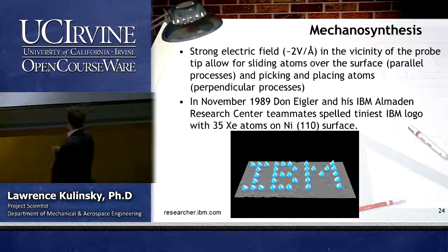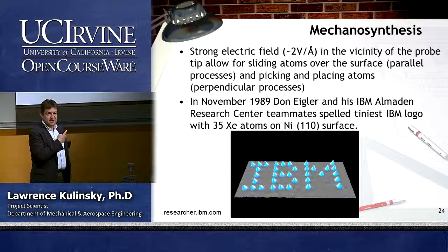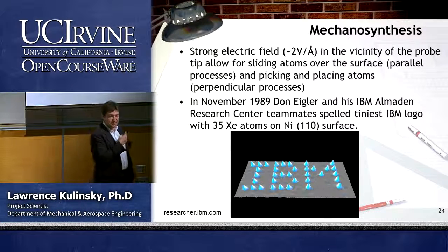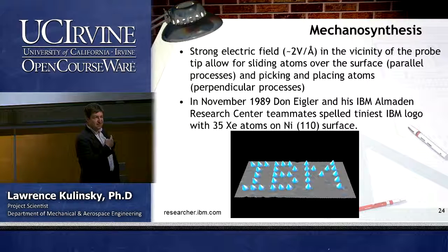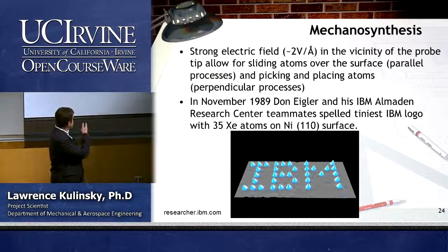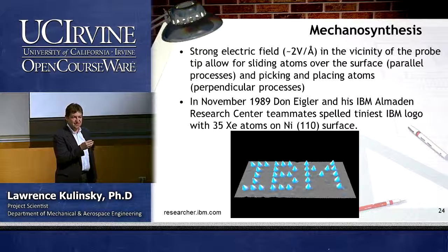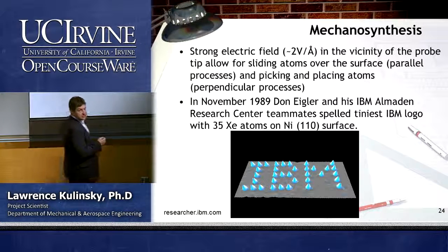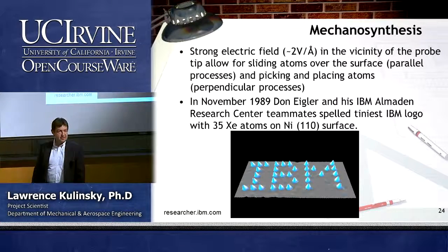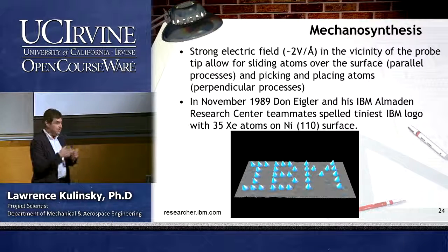So in November of '89, and that picture actually prompted me to go into material science. When I was a student, because I came to the United States in 1990, and I saw that, and I said, well, this is incredible. How can they do that? I still did not know for a long time how they did that. So I will tell you today how they do it. They did it with STM, okay? And I will tell you exactly how.